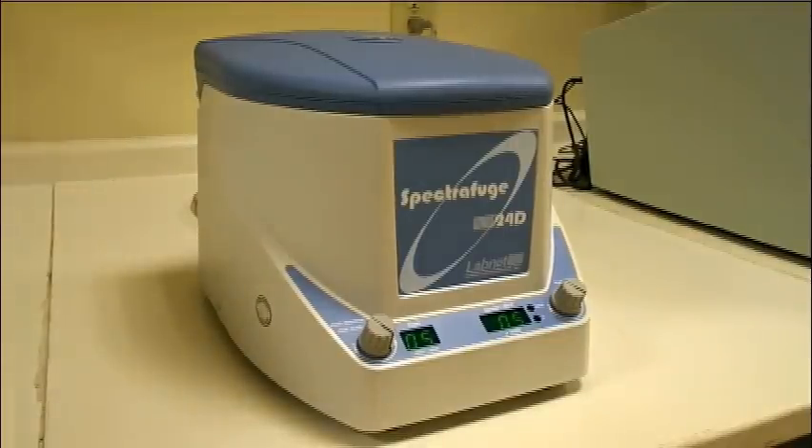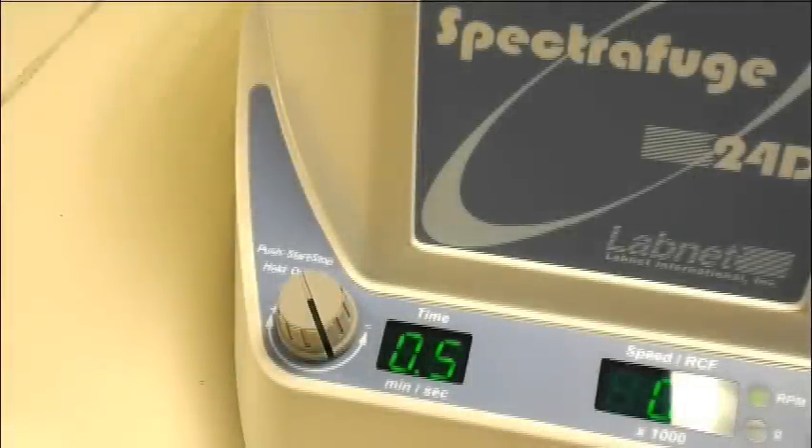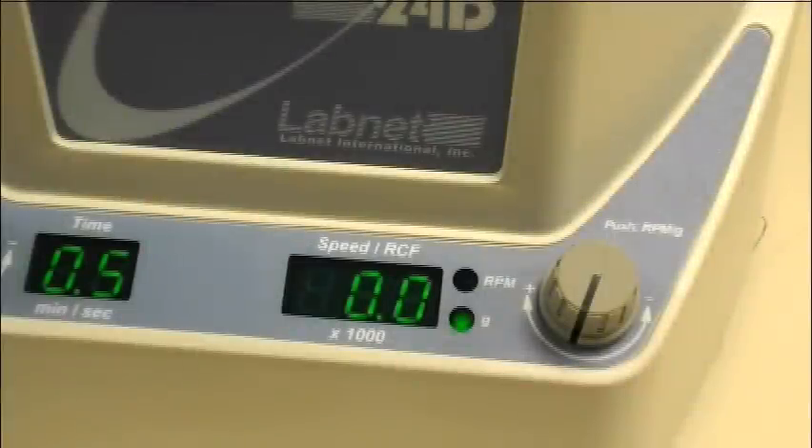Let's move on to the nitty-gritty. The 24D has two digital displays and two rotating knobs. The first set of controls, all the way to the left, gives you the flexibility to adjust a timer in increments of 30 seconds, all the way to a maximum length of 30 minutes. The controls to the right give you the ability to set speed in RPM or RCF. By pushing down on the knob, you can specify either RPM or RCF values. RPMs can be set in increments of 100, with a minimum speed of 500 and a maximum speed of 13,300 RPM.